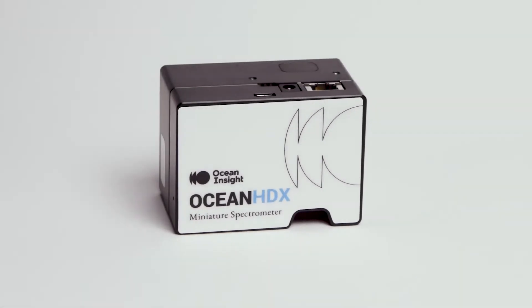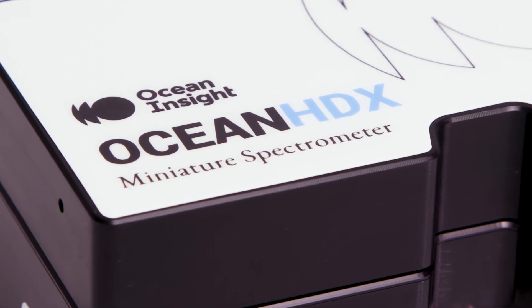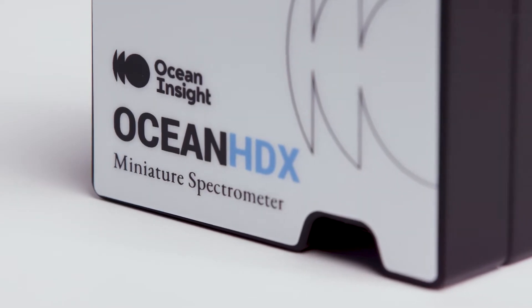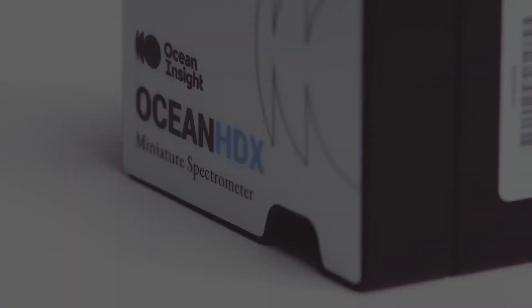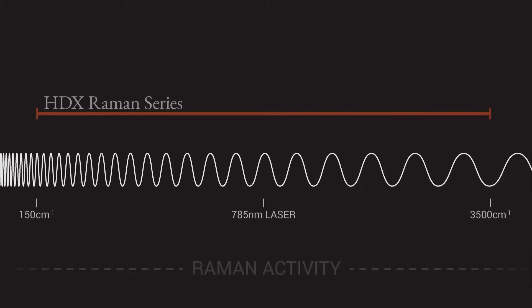In our continuing effort to bring spectroscopy to more and more researchers and scientists, Ocean Insight has launched the Ocean HDX Raman. The Ocean HDX Raman spectrometer is a compact, high-performance spectrometer for 785 nanometer Raman excitation — a wavelength that is sort of the sweet spot for making Raman measurements.